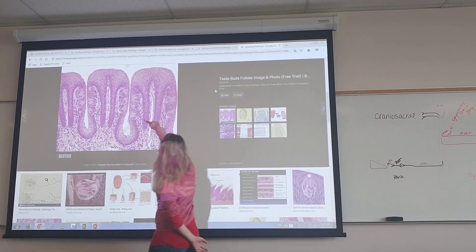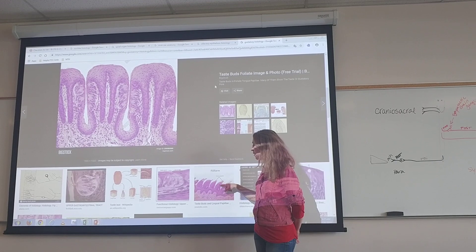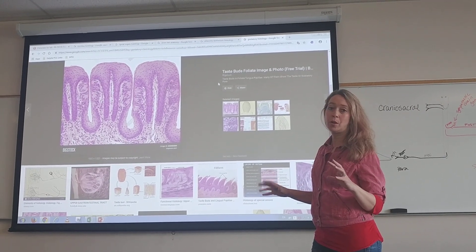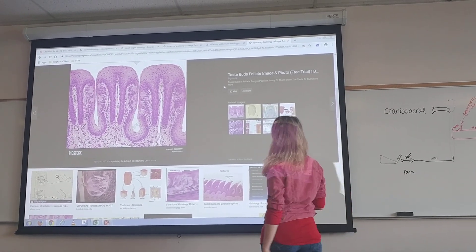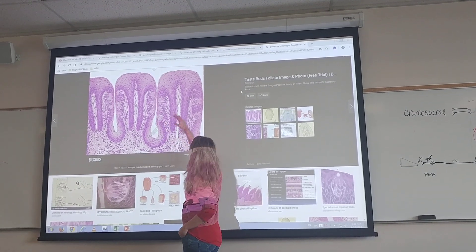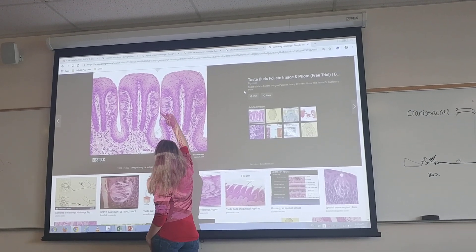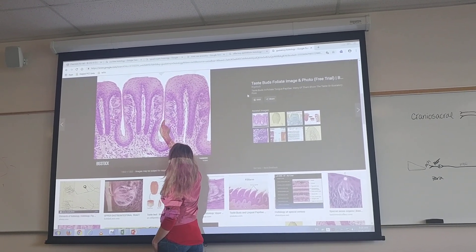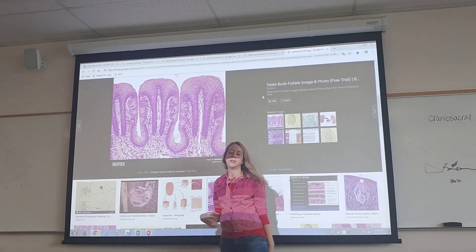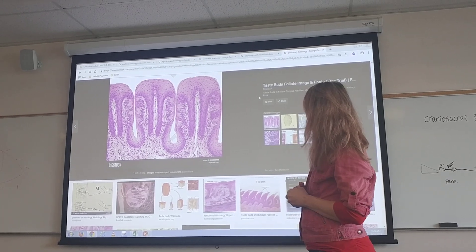You can see that whole shape all the way up and around. Microscopically you can see different types of the papilla, but we will not be doing that — on the model yes, not microscopically. What you do want to notice is the general shape. You do see individual taste buds, and the microvilli hairs would be coming out of this pore here — this is a taste pore. You want to know the three different kinds of cells: the basal cell, supporting cell, and the receptor cell.